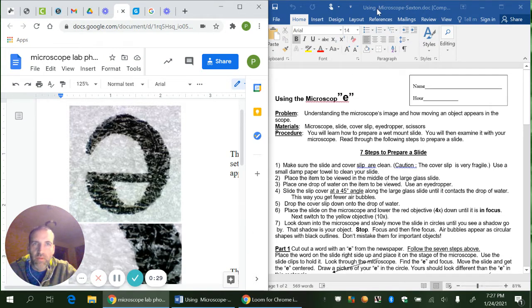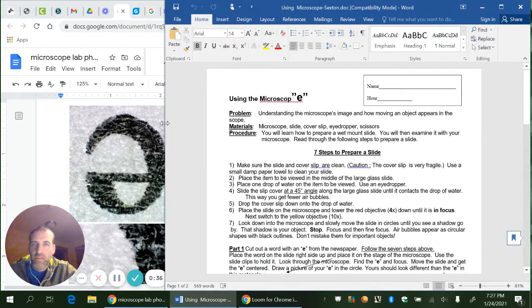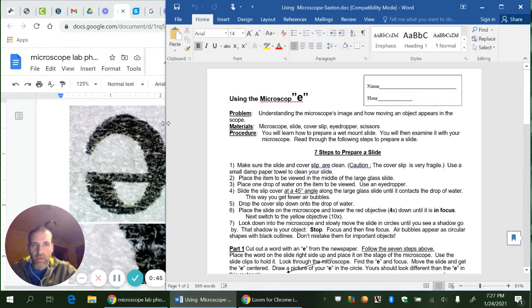So we are doing the using a microscope lab. This lab handout can be found in Schoology. It looks like this. You should download that and put it into Notability if you have not already. And I'm going to be stopping periodically and telling you to pause the video and do a couple of sketches and answer a couple of questions as we go.